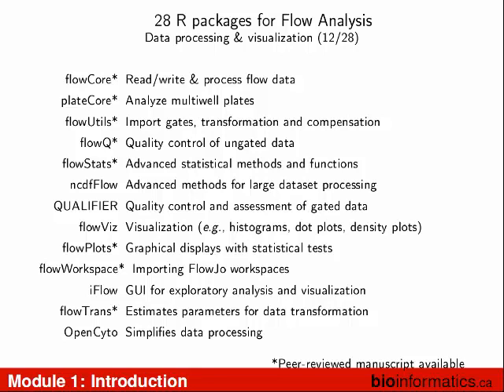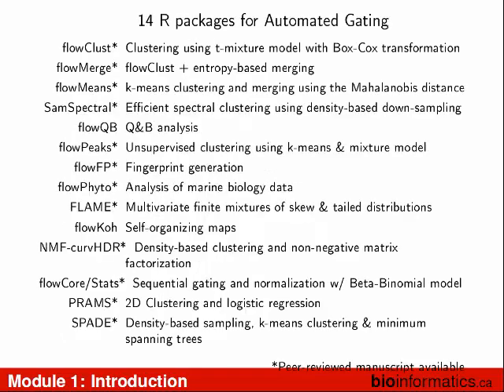Most of these, the ones that have stars, have papers associated with them. They all have vignettes. The peer review to get stuff into Bioconductor involves not only writing the code, but they make you write a description of how that code actually works on a real problem. So when you download these packages, you'll find these vignettes that tell you this is what you have to type in, this is what happens, and this is what it should look like. Since most of the people are academics, they usually have papers associated with them because that's how we get paid.